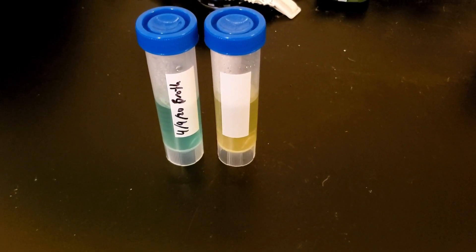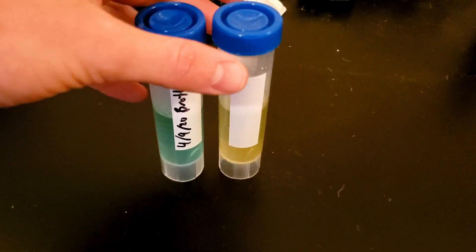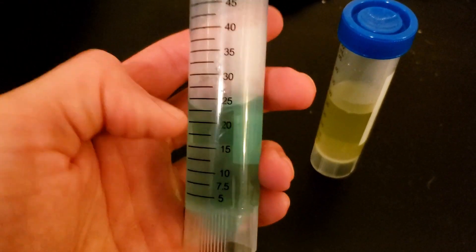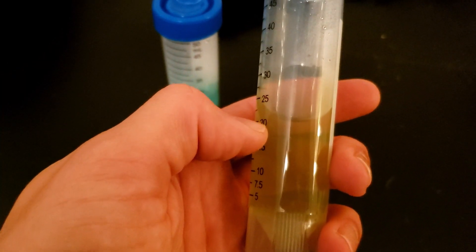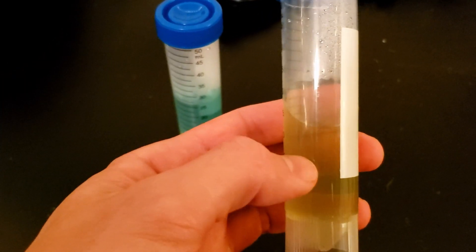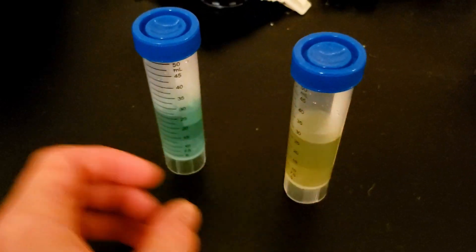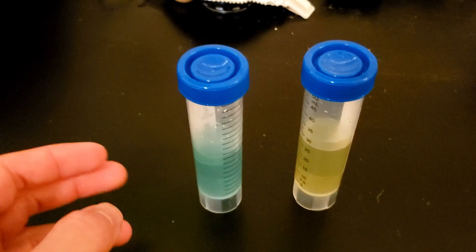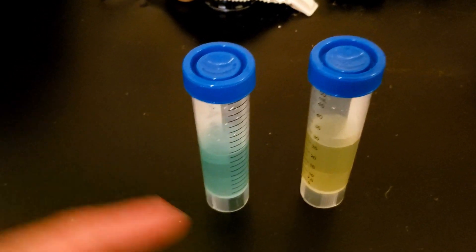Here's an update on the tubular flow fungi reactor. Remember, we fed through this blue solution? We got this on the other side, which I think is really interesting — this is sort of what the broth looked like before I added the dye. It really seems like the fungi either broke down the dye or absorbed it.